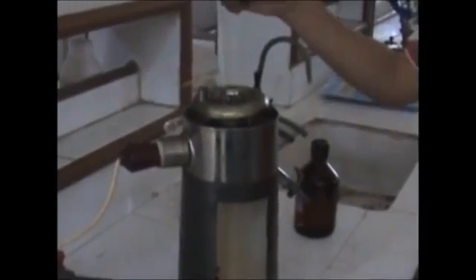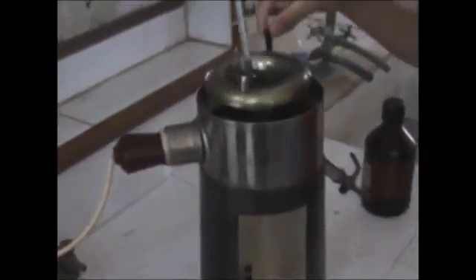Moving on to the other viscometer, the Redwood viscometer 1. As you will see, the apparatus is quite similar to Redwood 2. But you will notice that the orifice in this viscometer is smaller than Redwood viscometer 2. This enables it to take more accurate readings of lubricants having lesser viscosity. Moving on, you will see the same measuring cylinder and temperature regulator as in the Redwood 2.